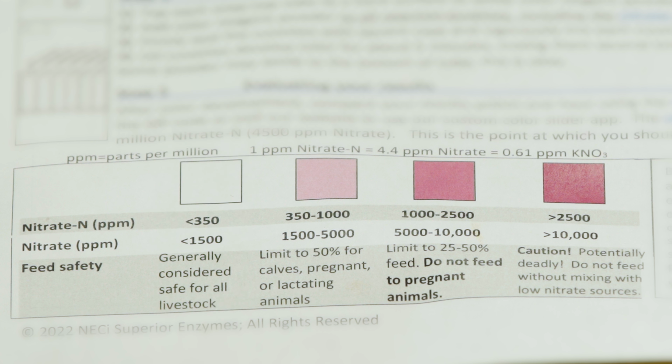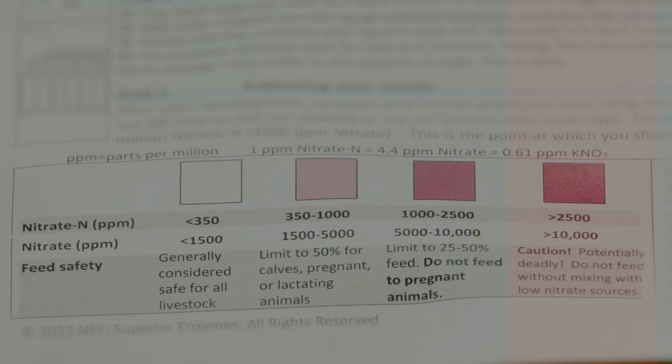If they are 350 parts per million to 1,000 parts per million, you should limit to 50% when feeding to calves and pregnant animals. If you are at 1,000 to 2,500 parts per million, do not feed to pregnant animals and limit to 25 to 50% of general livestock. Over 2,500 parts per million should not be fed to livestock and is considered lethal.